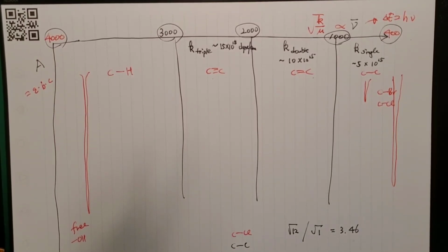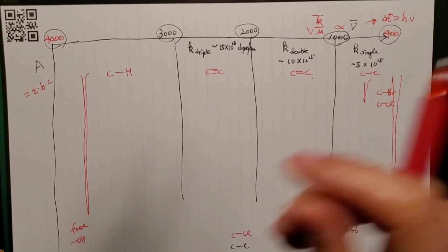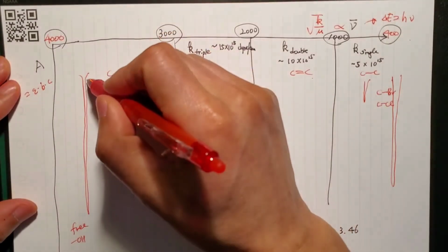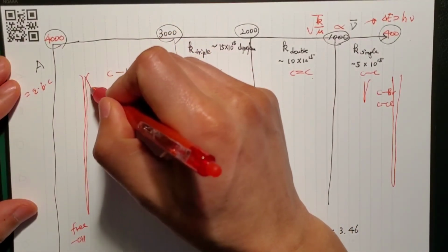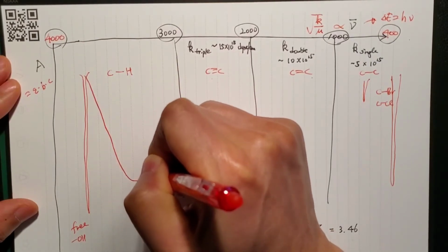But if you have hydrogen bonding happening, then the hydrogen bond is creating a weaker or stronger OH bond. So you experience a variety of hydrogen bonding, making a variety of strengths of the OH.